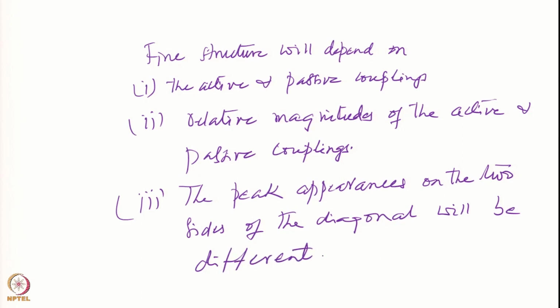So, these are the important features of COSY and double quantum filtered COSY spectra.